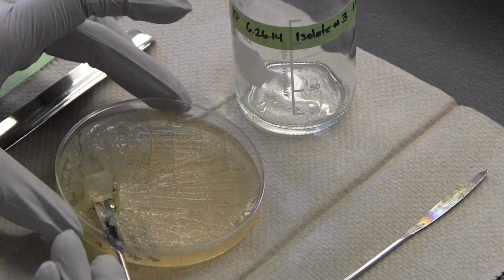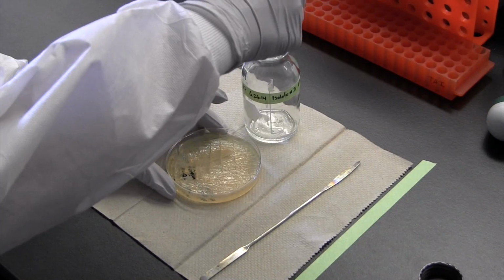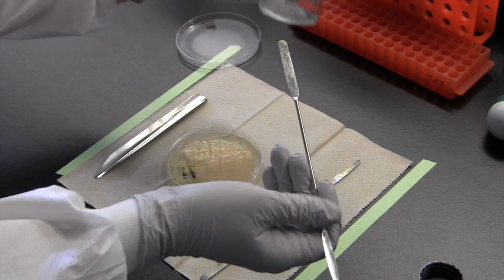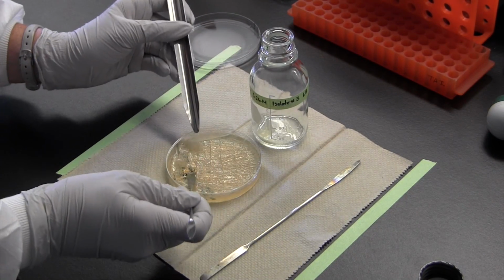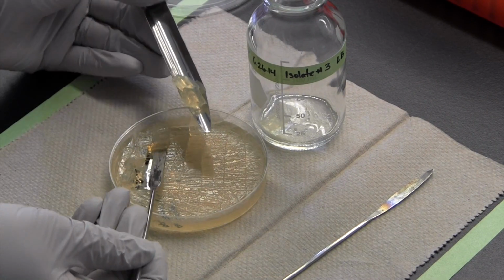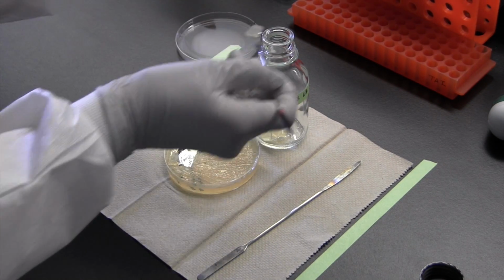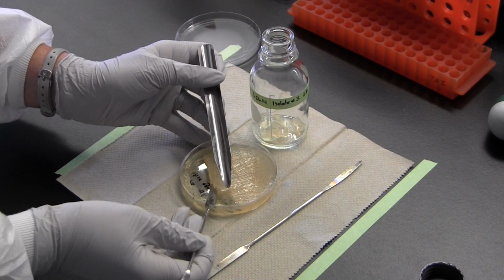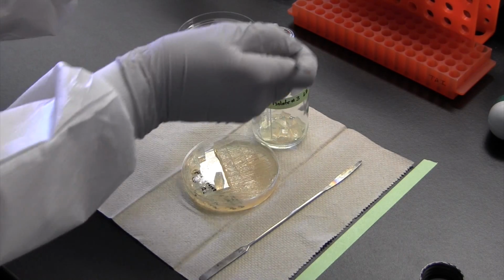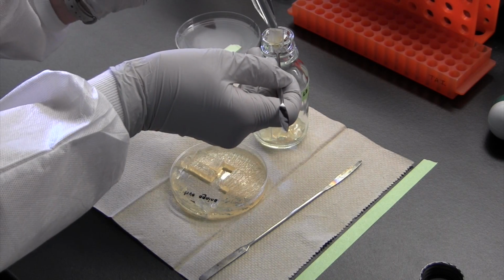So what you'll see is that it can be a slow process, and now you'll just watch as if I have only one, you kind of have to go one cube at a time, and then it's sticky and it fights you to get it off into the bottom of the jar. I liked using these types of spatulas because you could kind of line them up like this in the groove of the spatula and then use both tools to just complement each other. So whatever works for you in your particular lab, you're just basically going to take all of these different cubes and get them into the bottom of your jar, trying to not spill any in the surrounding lab space.